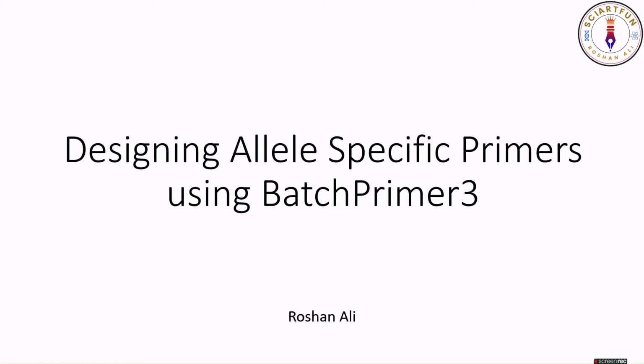Dear viewers, our today's lesson's objective is to show you the definition of allele specific primers, a brief introduction to ARMS PCR, characteristics of allele specific primers, designing allele specific primers, and the use of allele specific primers with animations. So, let's begin.